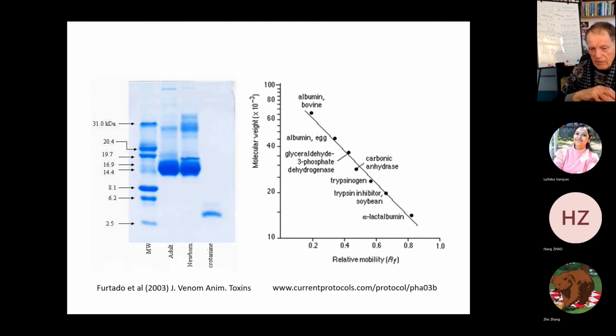So for DNA electrophoresis, it's different. You don't use SDS, and we use a different type of gel. I think that's relevant to the DNA question we've given you on the assessed questions. I forget which question number that was. Okay, so bear that in mind.